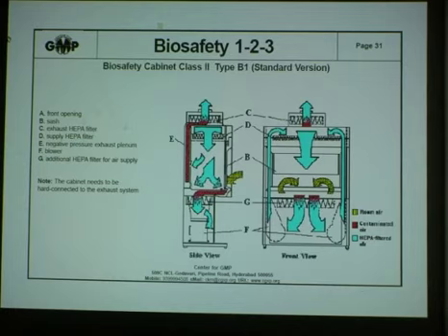So no contaminated duct is under positive pressure. The duct connecting the blower at the work surface bottom to the plenum above the work surface, that duct is not contaminated. The air has been filtered out.